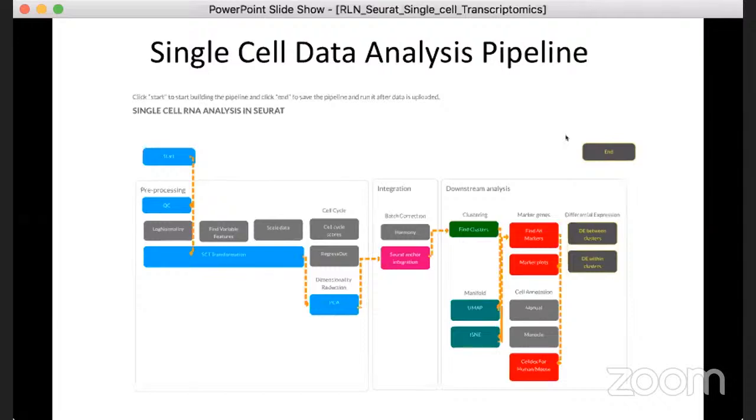They specifically include quality control, to leave out bad quality cells and select only good quality cells for each sample, and to normalize the data for each sample, to correct for the batch effects, and to correct for other problematic variations in the data. And we further have to select the specific dimensions or number of features based on the very high variability that they can show.